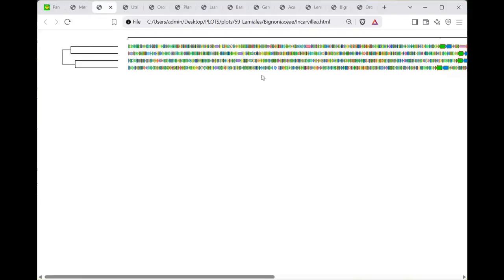You can see how many small fragments are here, and you cannot really highlight any sequence that is conserved, or cannot do that easily. Maybe there are these small fragments which are conserved, but they don't show as nicely as in the previous figures. The length of these sequences is around 160,000, somewhat longer than the other ones, but in the same ballpark.